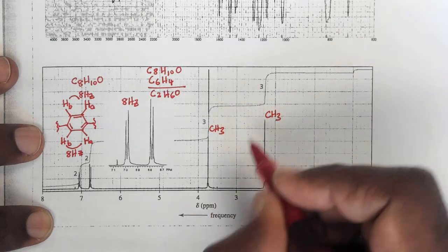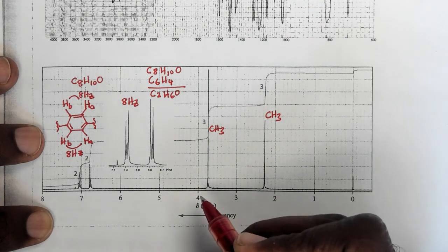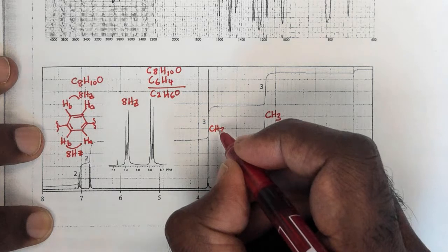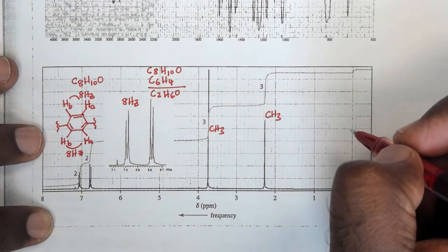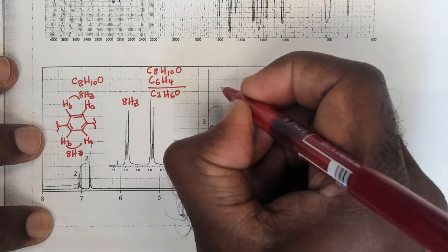And remember, when we de-shield resonances with atoms, especially electronegative atoms, they move to around 3.4, 3.5, closer to 4. So on this methyl group here, I must have an electronegative atom. If I look at my molecular formula, I just have an oxygen atom left. So I can bond the oxygen atom to that CH3.